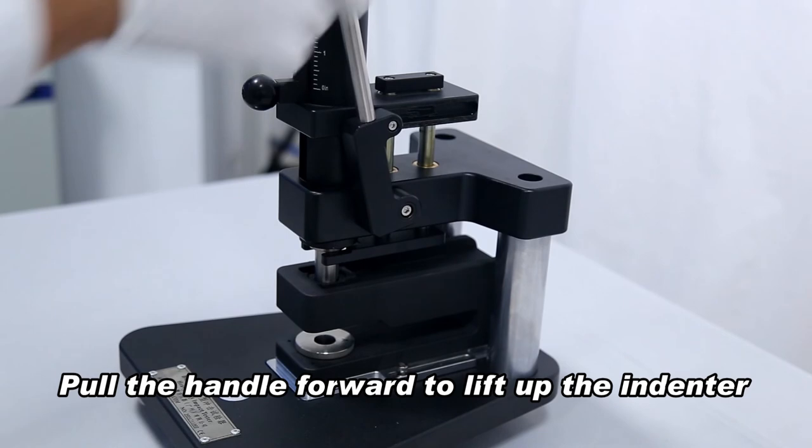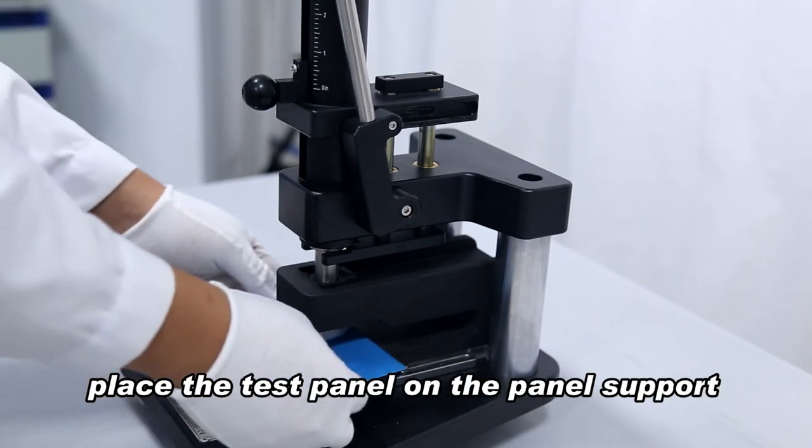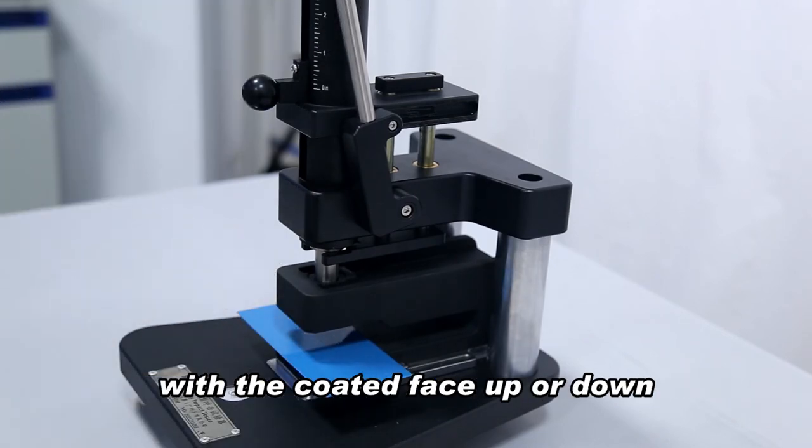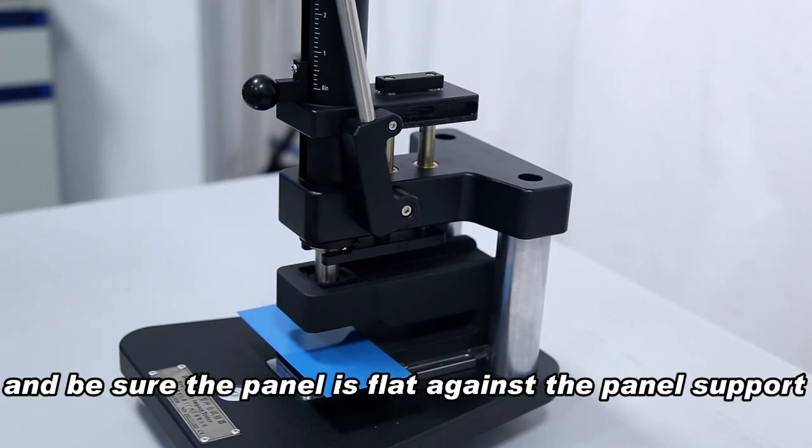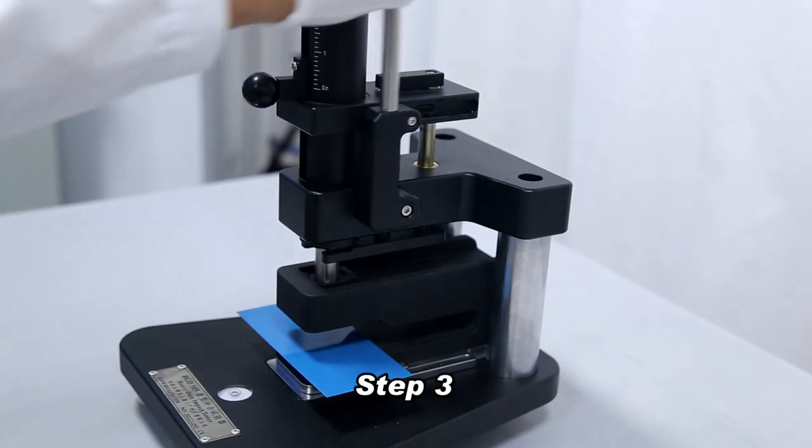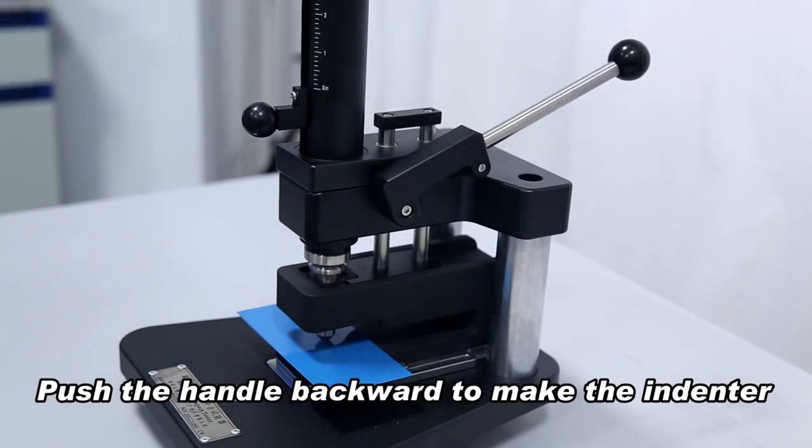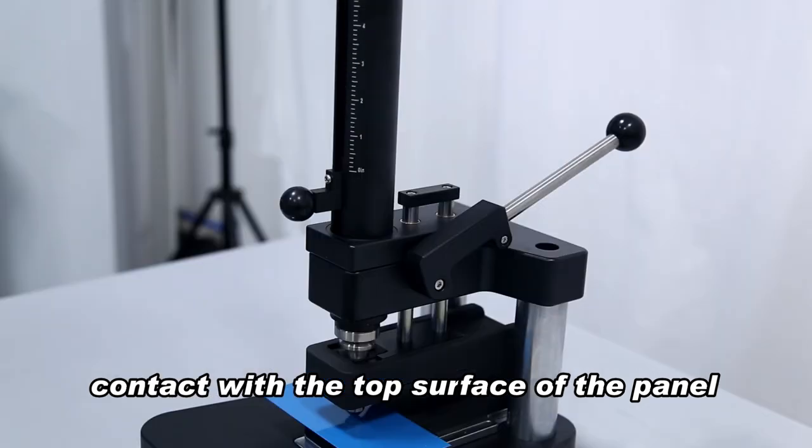Pull the handle forward to lift up the indenter. Place the test panel on the panel support with the coated face up or down, and be sure the panel is flat against the panel support. Push the handle backward to make the indenter contact with the top surface of the panel.